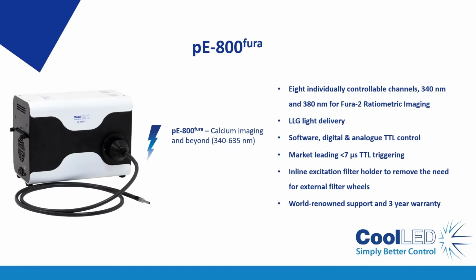Multiple parameters can be tightly controlled through many popular imaging software programs, and as you will see, it works particularly well with the INSCOPER solution. Our product offers many parameters to control, and the INSCOPER solution provides a seamless interface. It's a perfect match.